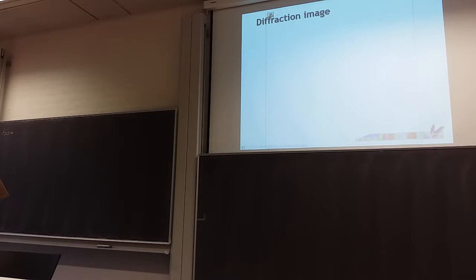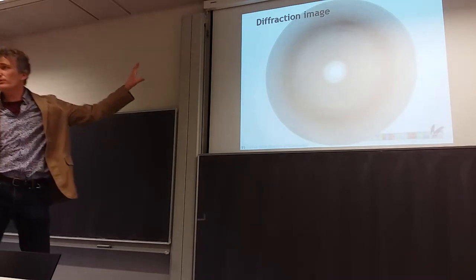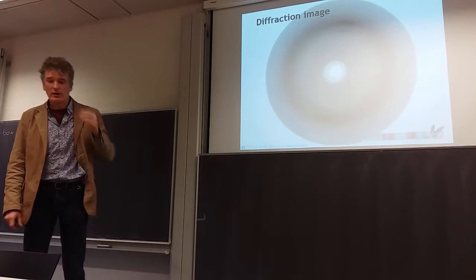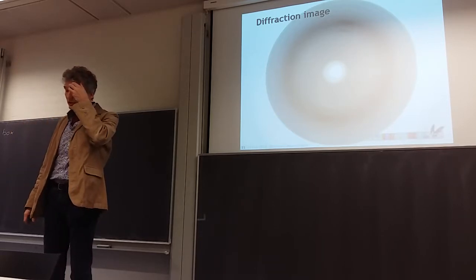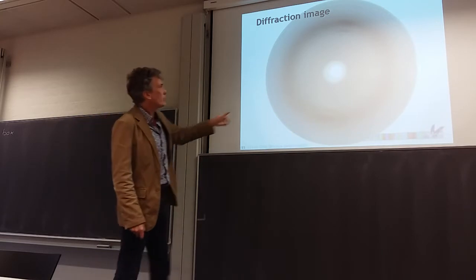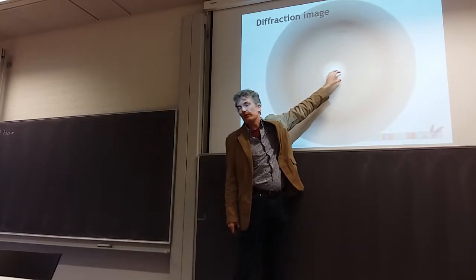Good. Yes. So this is just a random diffraction image inherited from teacher Sixma. She's doing crystallography at the Dutch Master Institute. Here you see the white bit is where there's no radiation hitting the detector, because that's where the beam stop was.